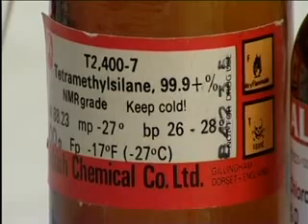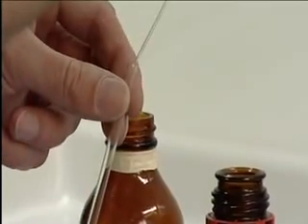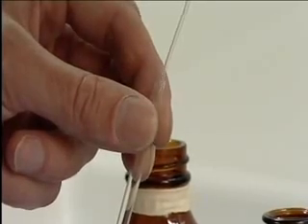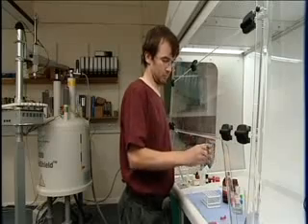A little tetramethylsilane, TMS, is often added as a reference. Each molecule of this has 12 hydrogen atoms all in exactly the same environment. The signal from these is taken to be the zero of the spectrum and has the value of 0 parts per million.